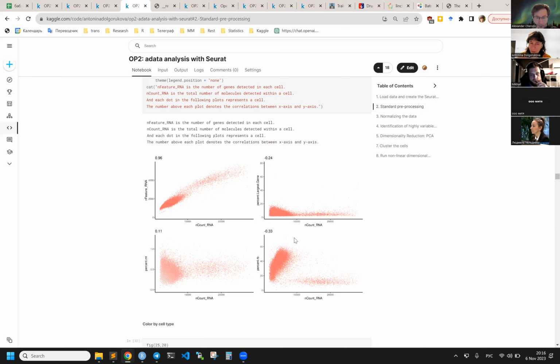And I did a huge work to investigate and examine all the data we have. I believe it's not clear at all for most of the people who just started and look at this and think, oh my God, what do I have to do with this? Nothing is clear.